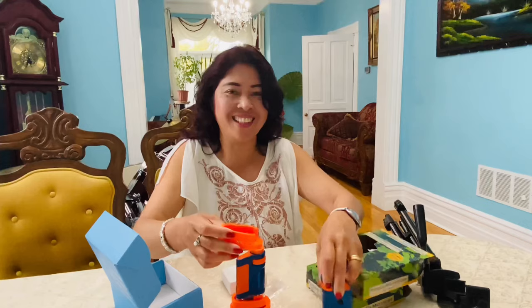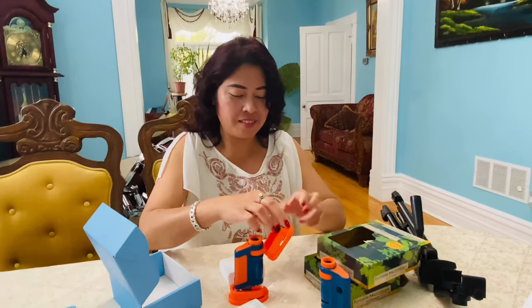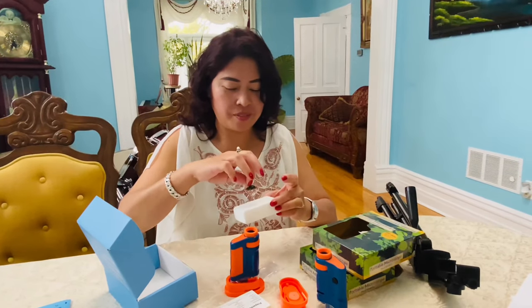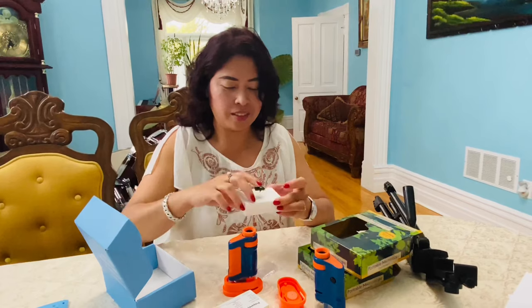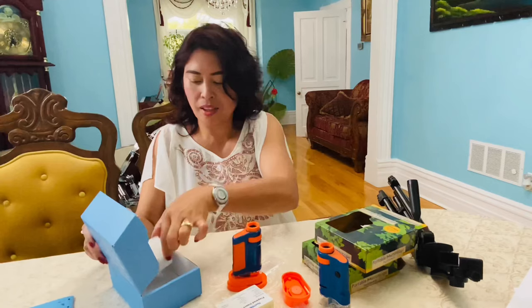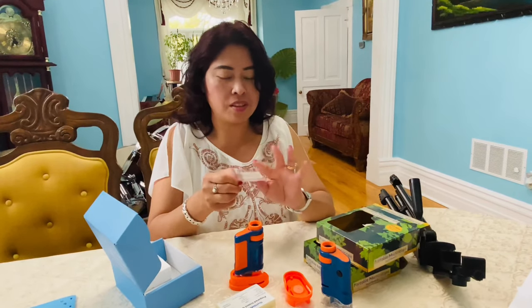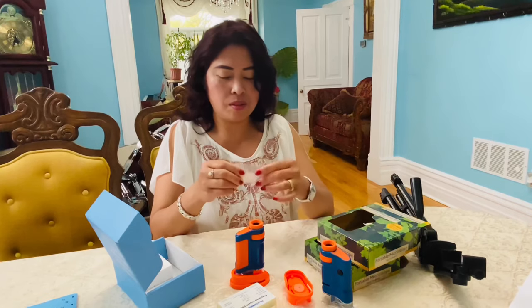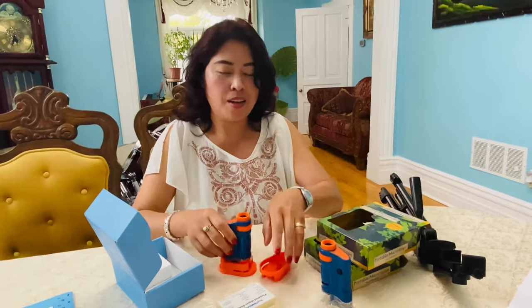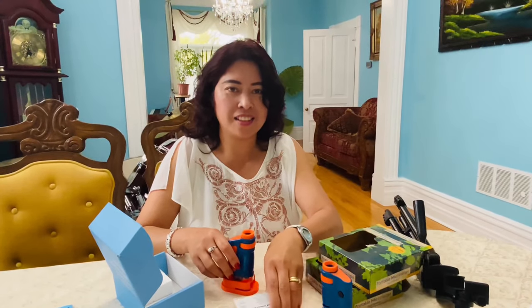After you're done, remove it, throw away the garbage, wash your hands. This one here is a sample — just put it back. If you used a slide, just wash it with water and soap, dry it, and put it back in the kit. Right now we are going to the backyard — the kids are excited!